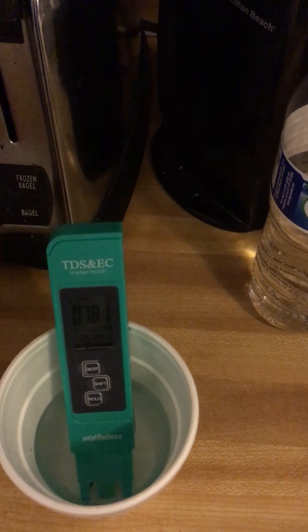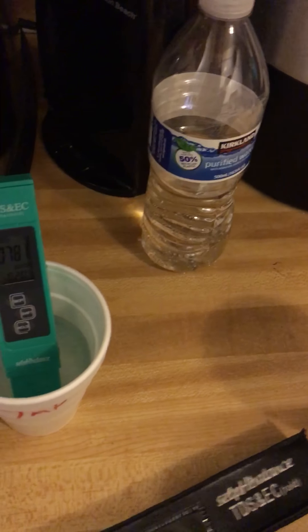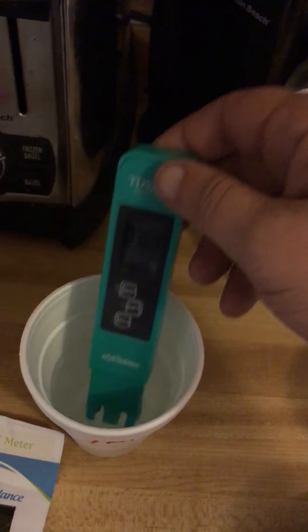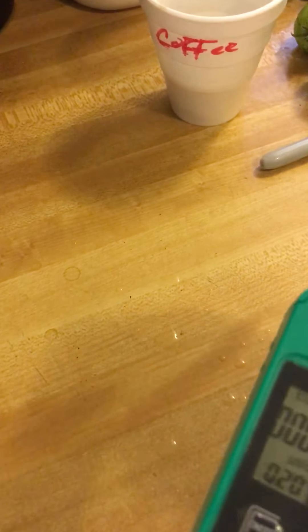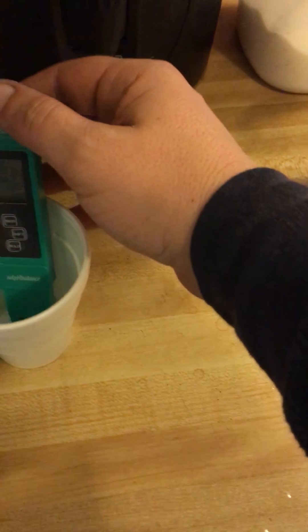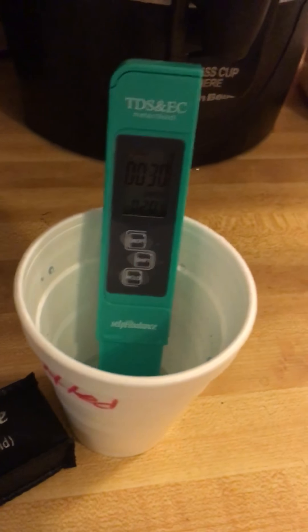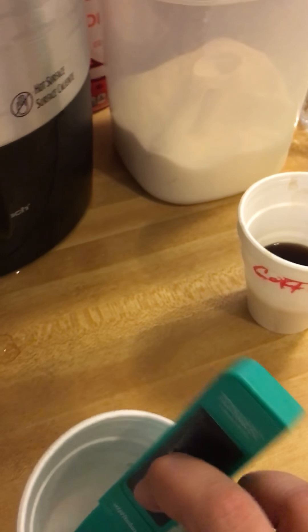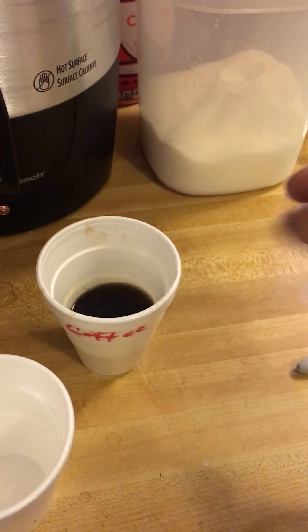That could point to needing carbon filtration. Anyway, we can definitely see there is a big difference between the tap water and the bottled water. Let me try the bottled water again. I am really bad at handling water, guys.